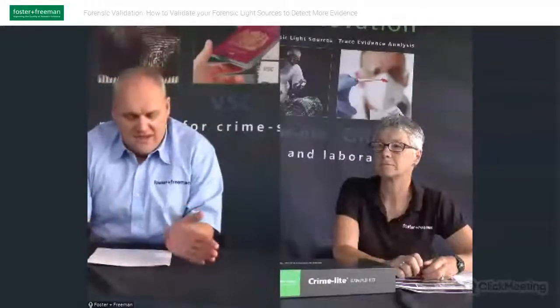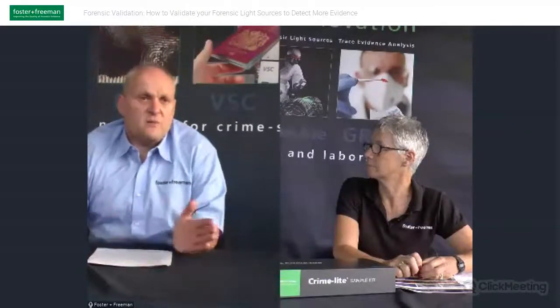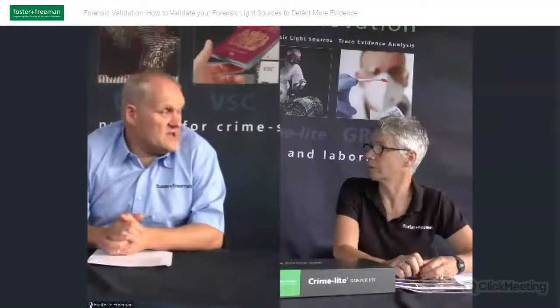Whereas with the old xenon or metal halide lamps, after 10 hours of use, they can have their intensity drop by 10%, and over a slightly longer period, they can drop by up to 30%. So it also depends on the type of light source you're using. The older lamp type light sources have their intensity drop much more rapidly compared to an LED or a laser type product.